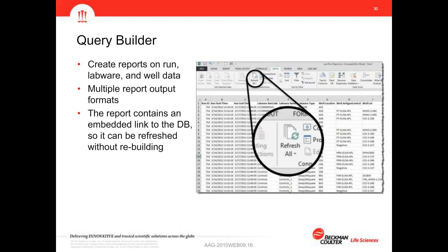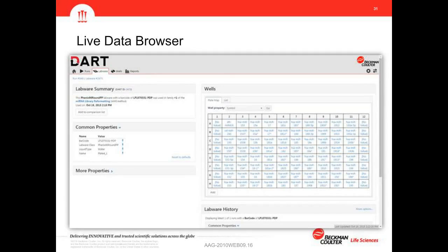So as you perform new runs or have more daily operation, you can have cascading charts or other sheets that evaluate from this named range of data. And as you run more samples through your system, more information is available through the spreadsheet. So rather than producing a new spreadsheet every day, you're able to just click the refresh button. All that information comes into the system, all of your charts and graphs update, and you can use the same tool one day to the next, get that spreadsheet optimized for just the way that you like to look at it.